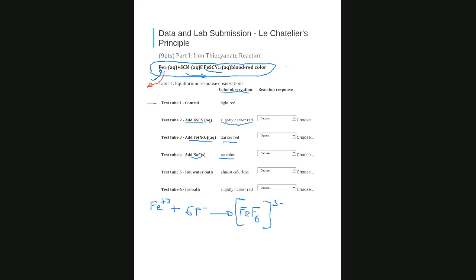Then it says what happens when you put the system in a hot water bath. It says almost colorless. You know which side. And what happens if you put it in an ice bath? It says darker red, which means it goes, we know which side is red, right?